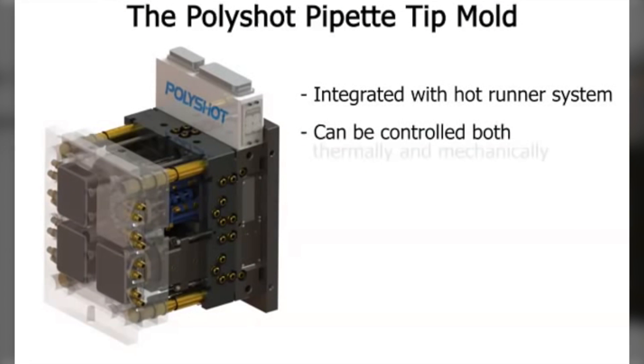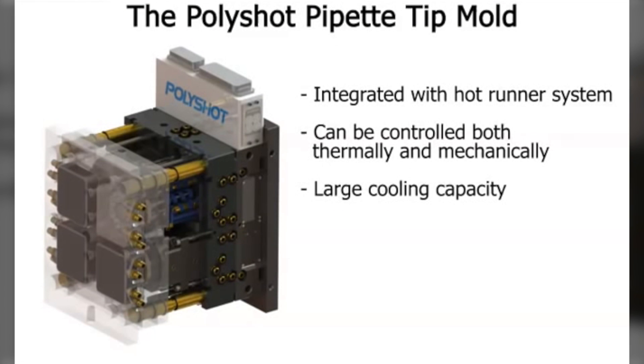The PolyShot Pipette Tip Mold was conceived, designed, and built as a complete integrated system with the hot runner system. This thinking allows the mold to be controlled and adjusted both thermally and mechanically, resulting in the best pipette tip possible. The features and design of this mold are the result of input from some of the world's finest and most skilled producers of pipette tips.